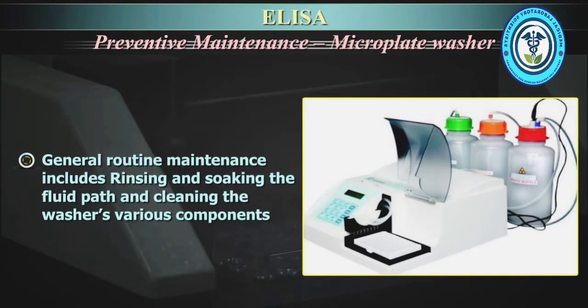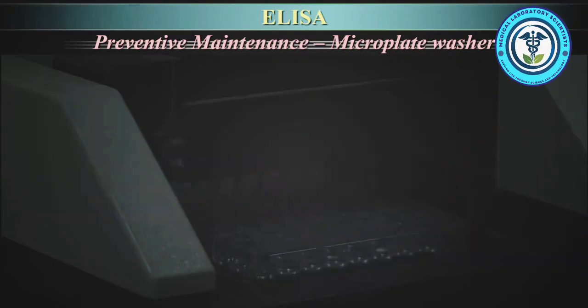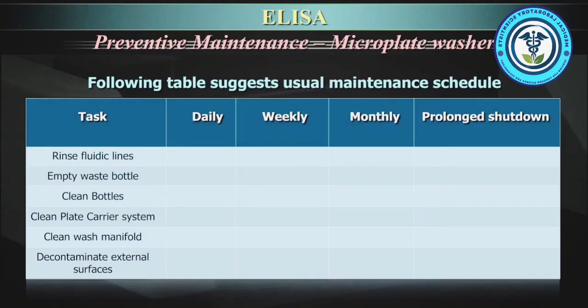General routine maintenance includes rinsing and soaking the fluid path and cleaning the washer's various components. The following table suggests usual maintenance schedule.